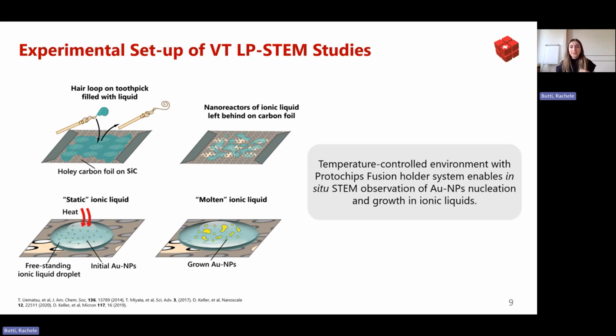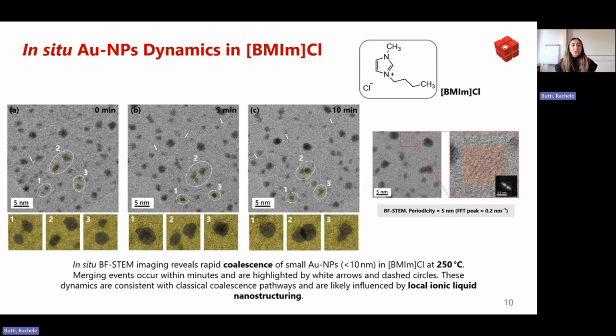And therefore, this temperature-controlled environment with a Fusion single tilt holder enables the in situ STEM observation of all the atomistic mechanisms that happen in the microscope regarding the gold nanoparticle formation. So here we have first successful results of in situ gold nanoparticle dynamics in an imidazolium-based ionic liquid, which you can see here on the top right of the slide.